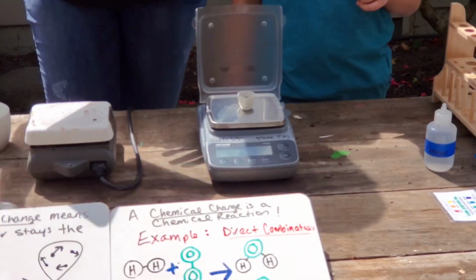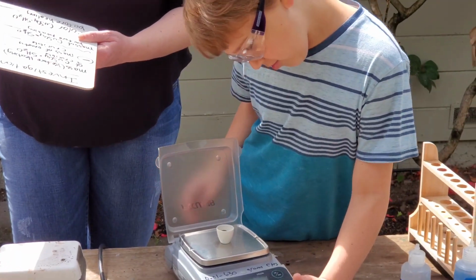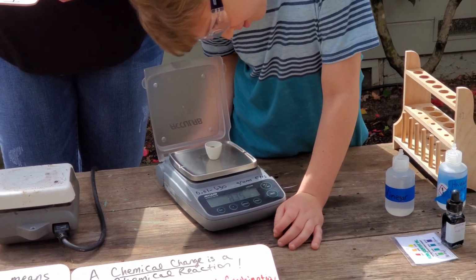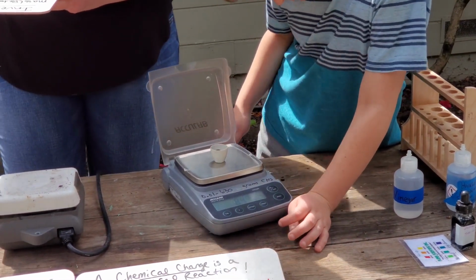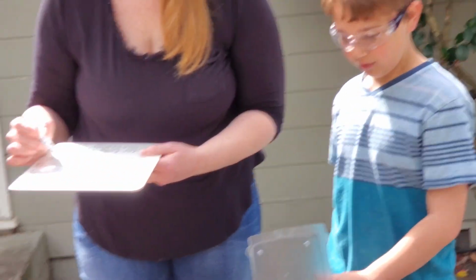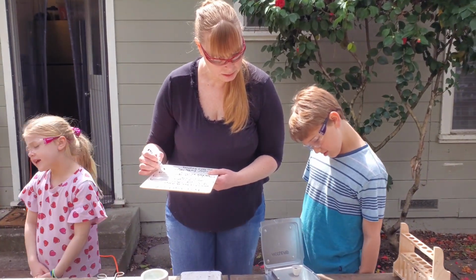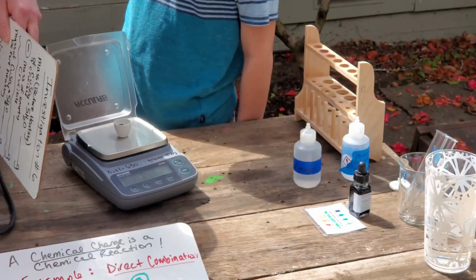Troy, can you tell me what it says, and we're going to fill that out. Empty crucible. Just pick a number it stays on the most. And don't push on the table. 8.36 is right. It said the most. 8.36.